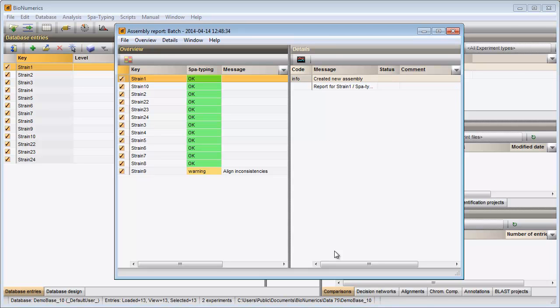The overview panel displays the entries as rows and the experiments as columns. Each cell provides information about the current status of an assembly project. In my example, most sequences were assembled correctly and the corresponding cells have a green color.